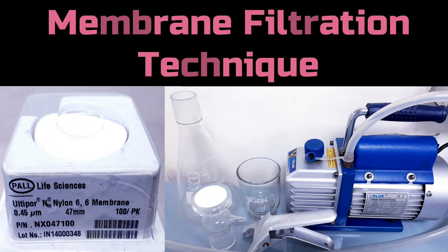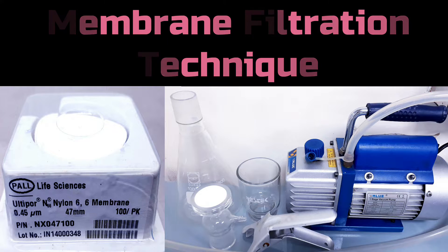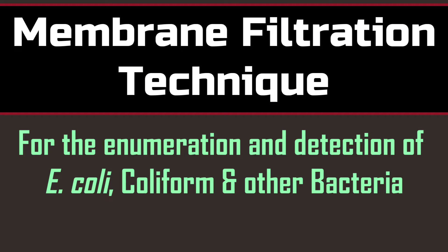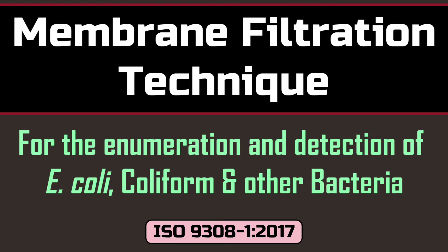Membrane filtration technique is a very common and effective way to enumerate or detect specific microorganisms or a group of microorganisms in a water sample. This method is normally used when the microbial number is low in a water sample. Today we are going to enumerate E. coli and coliform bacteria in a water sample using the membrane filtration technique.